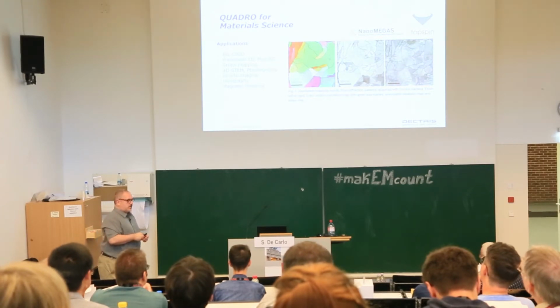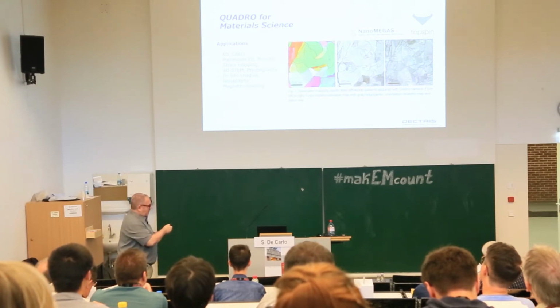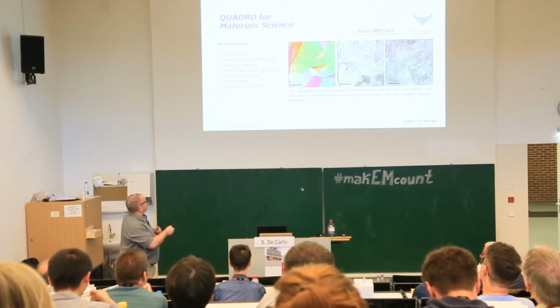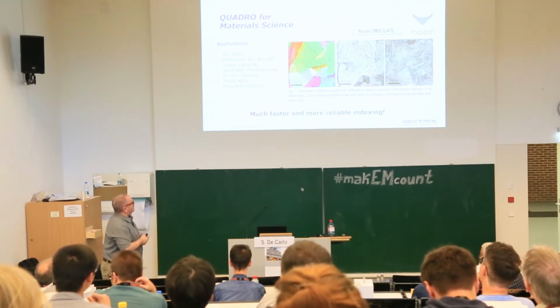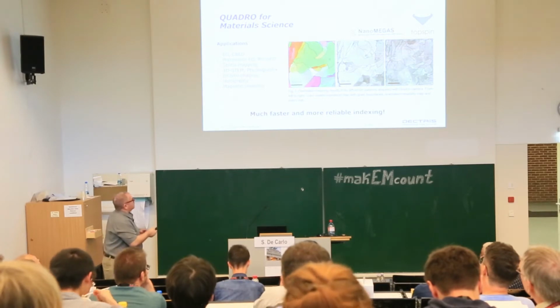If you have questions at the end, I will refer to my colleagues, because I'm a life scientist, so I do understand what I look at, but if you have specialized questions, I may not be able to answer, but we'll get there. What is good, they tell me, is that with our detector you can get much faster and more reliable indexing, and that refers to the strain mapping.